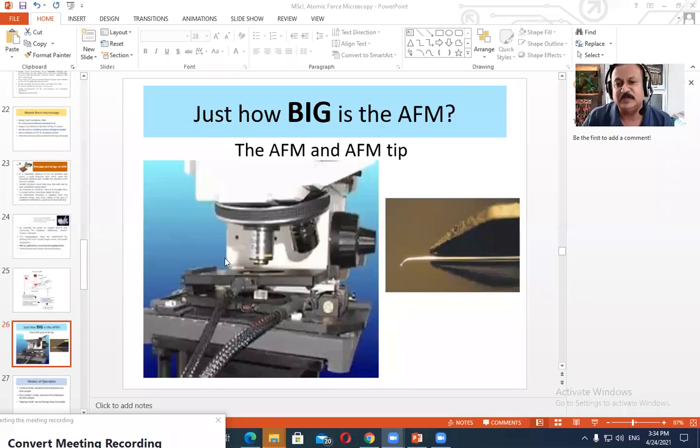Okay, so the size of the atomic force microscope is so small that it can fit in the gap between the objective and the slide platform, or stage, of the compound light microscope. But the cost is very high. It is beyond 1 crore.